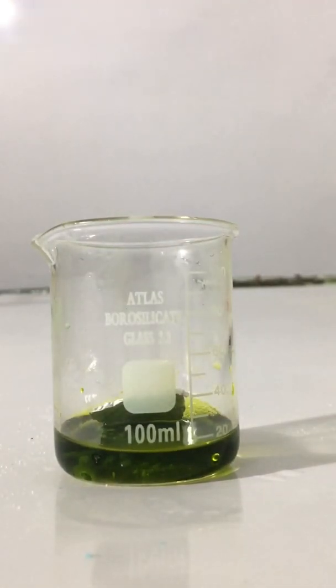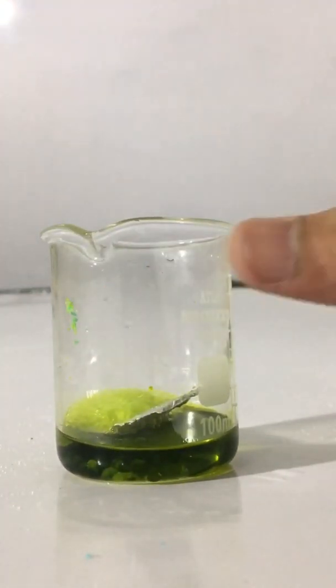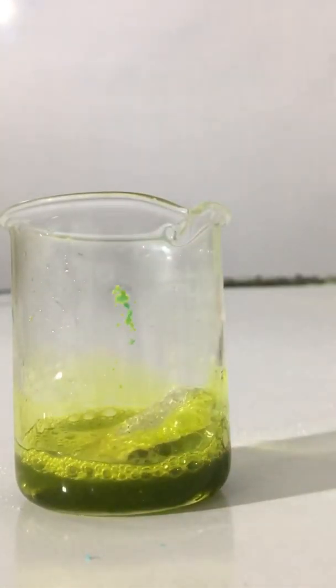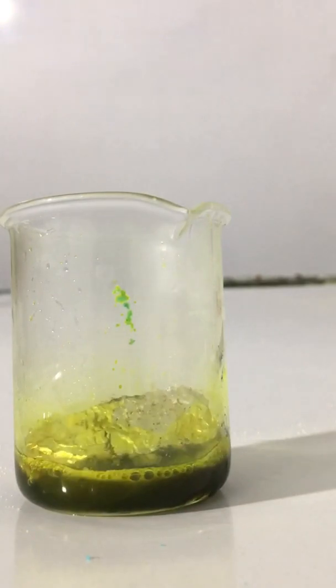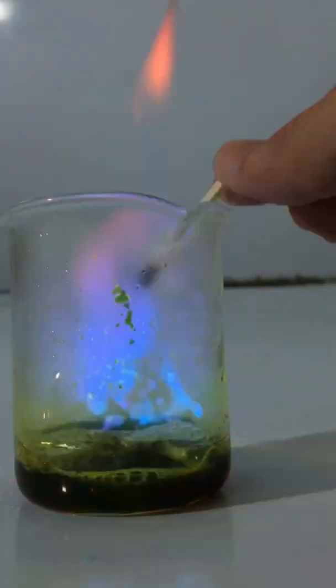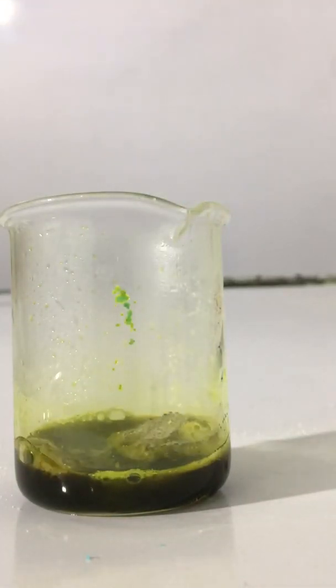You have to introduce flame, and you will notice the release of hydrogen gas. You have to shake it slightly. You can see the hydrogen gas is released. That is a blue flame you have noticed.